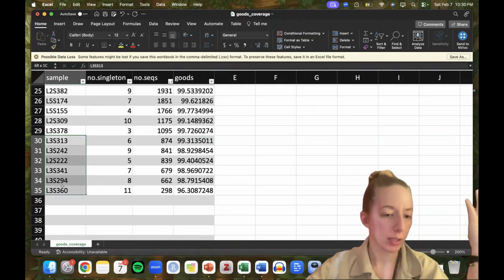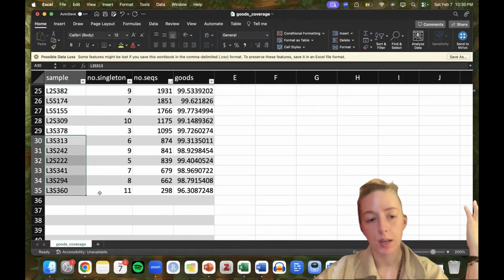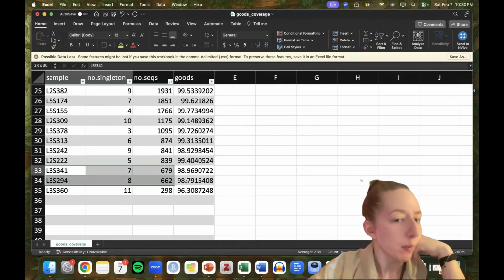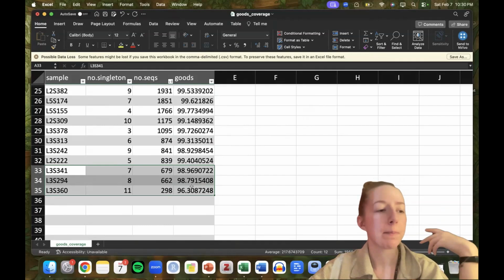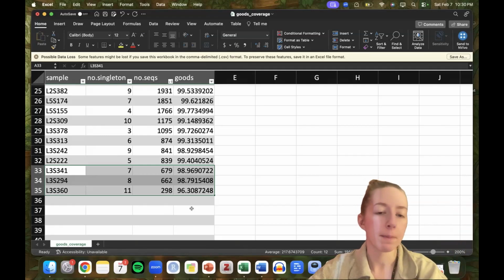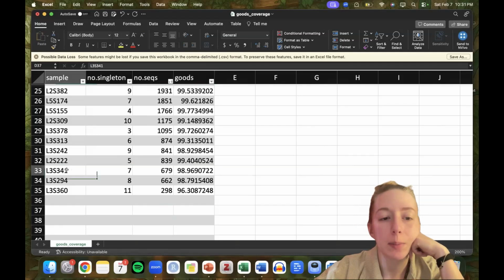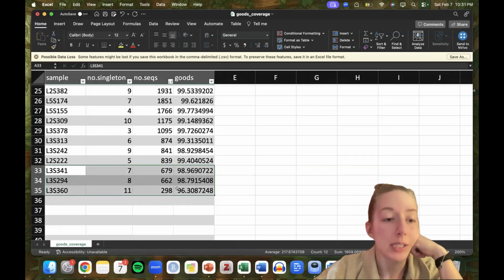You're going to have to ask yourselves, if you're the experimenters and the investigators, are these samples important, right? Maybe they're not important. Maybe they're supplemental in a way where if you remove them, you'll still have statistical power in comparing your groups, right? So it really depends on how much these samples matter.